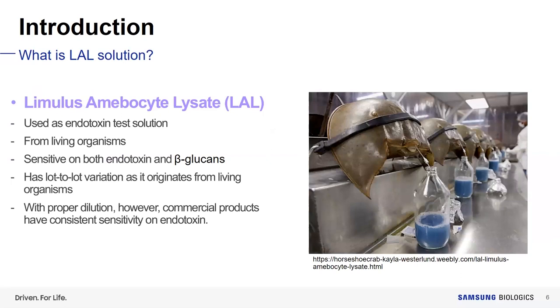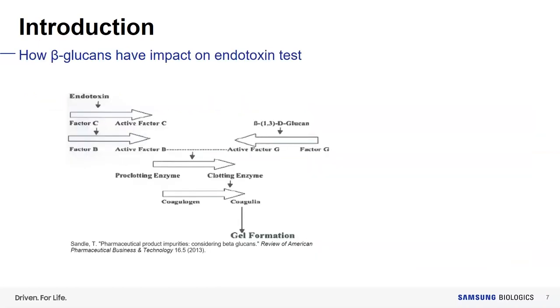For endotoxin testing, Limulus Amebocyte Lysate — LAL solution — is widely used. The blue liquid shown is the blood of the horseshoe crab, and LAL solution is made using this blood. LAL solution is not only sensitive to endotoxin but can also react with beta-glucans. However, because it is derived from living organisms, there is significant variation in the sensitivity to both endotoxin and beta-glucans. To be commercialized, the product needs proper dilution for consistent endotoxin sensitivity.